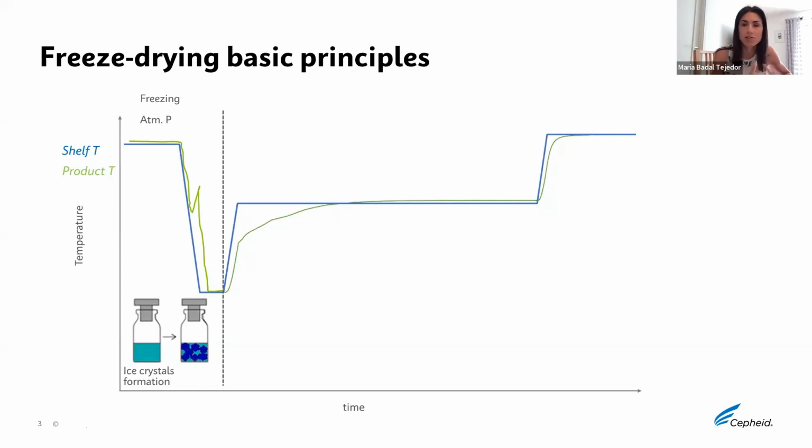One is the ice crystal phase, and the other is the so-called freeze concentrate, where all the other components that were in solution before get in close proximity to each other. In some cases we can even differentiate a third phase, if we have a component that crystallizes. Then we have the crystalline phase of that component.